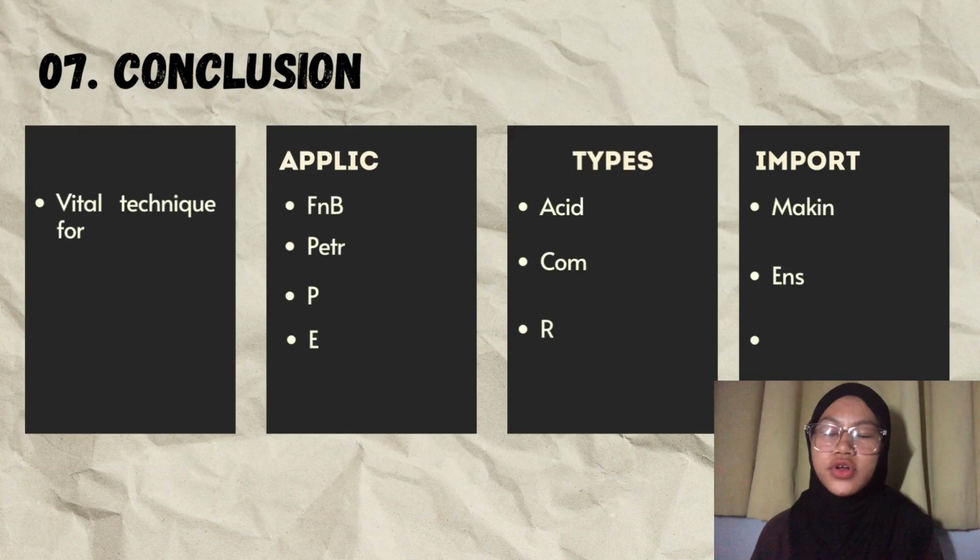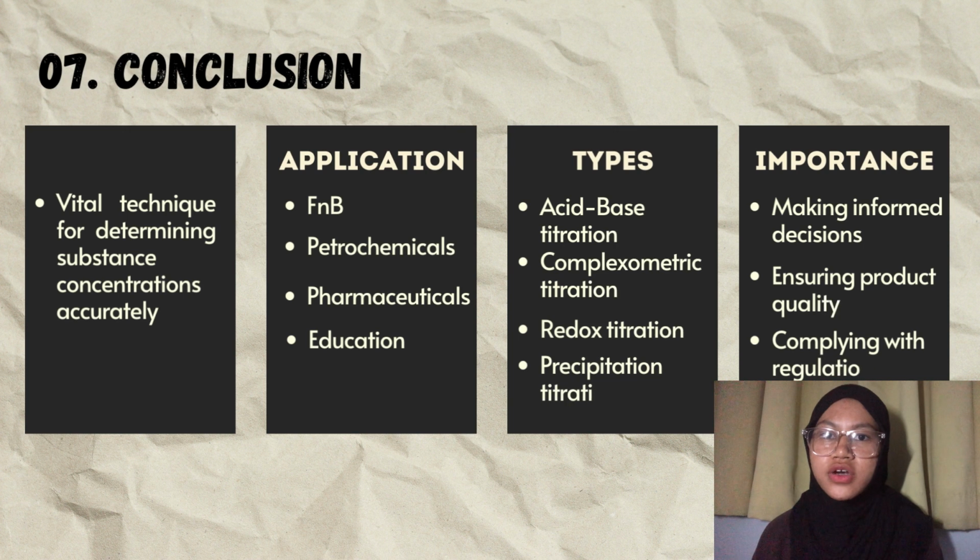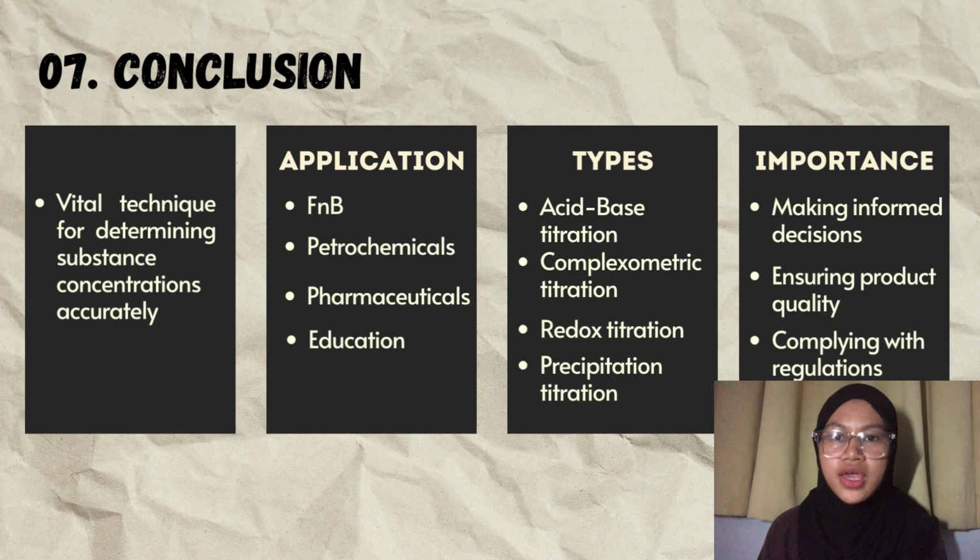To conclude, volumetric analysis is such a vital technique for determining substance concentrations accurately, and we can see that these techniques are applied in food and beverages industry, petrochemicals industry, pharmaceuticals industry, and education industries.